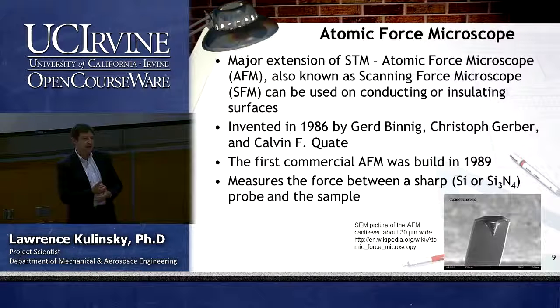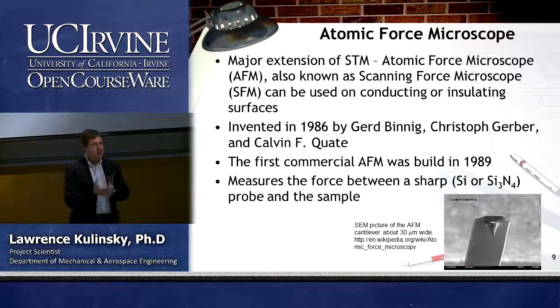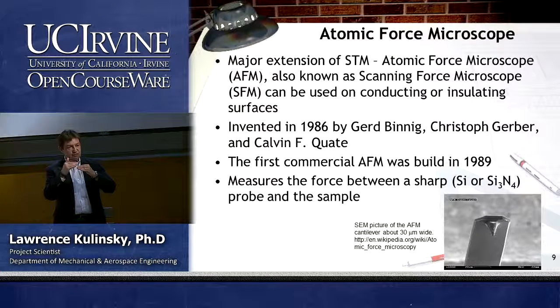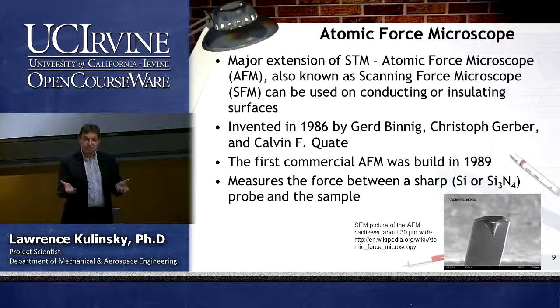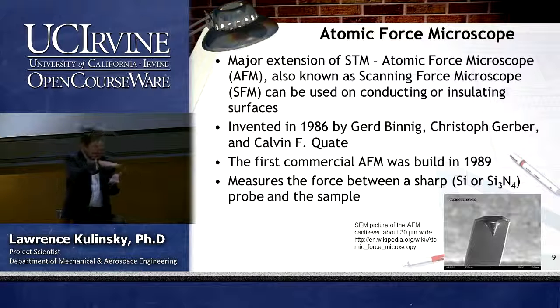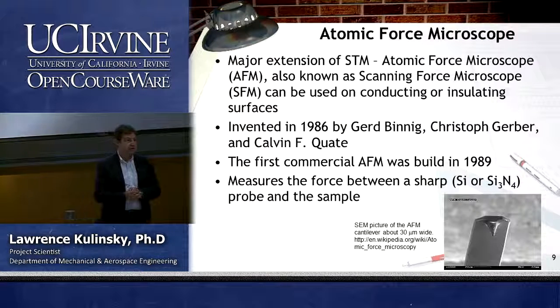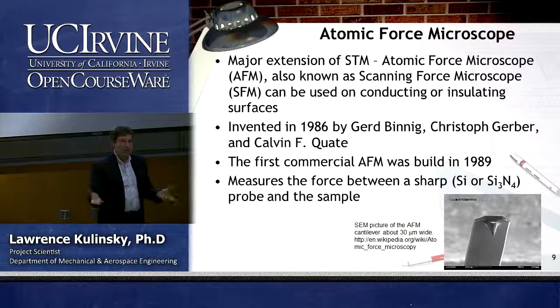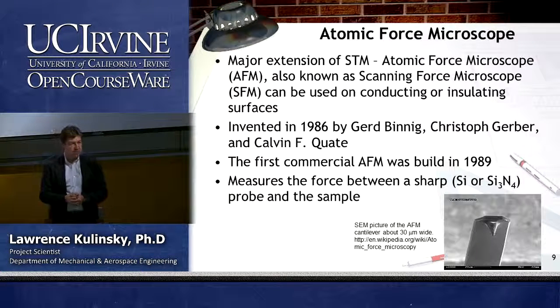The precursor to that invention is the main problem with STM. As we discussed, the way to measure surfaces with STM is via tunneling current. So what does it tell you about the sample surface? It should be only a conductive surface. You cannot have an insulator, because you need a conductor in order for current to pass. You can have metals and semiconductors with STM. This is very neat, but what about live cells? What about insulating materials? There is a lot of stuff that does not conduct current.